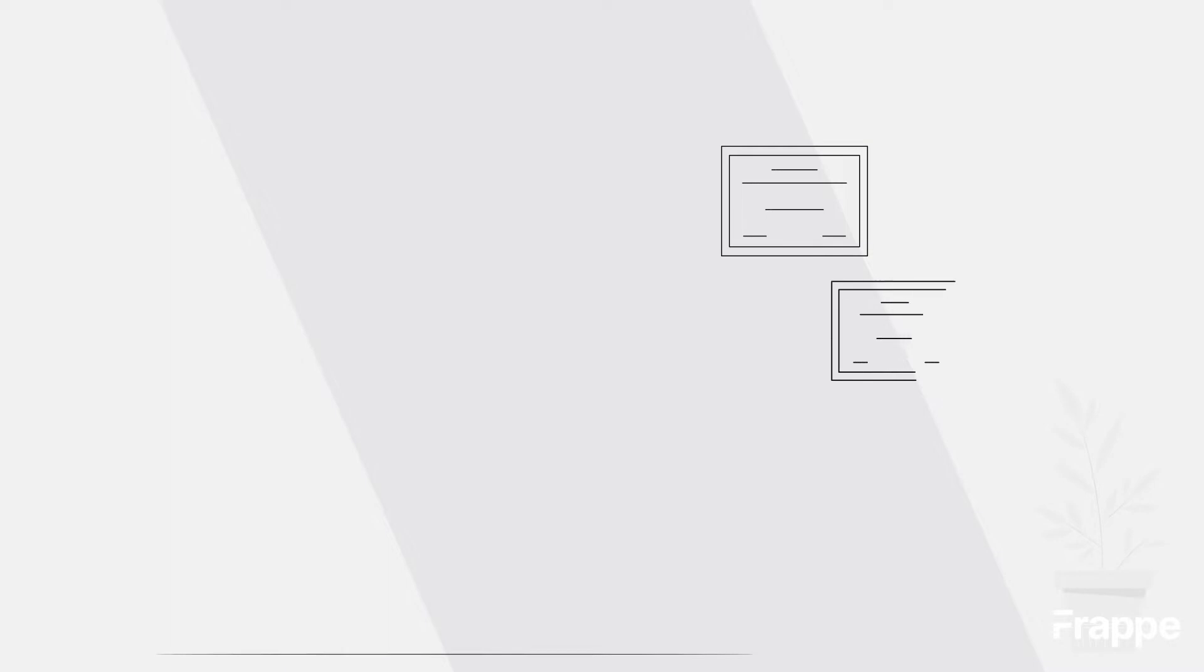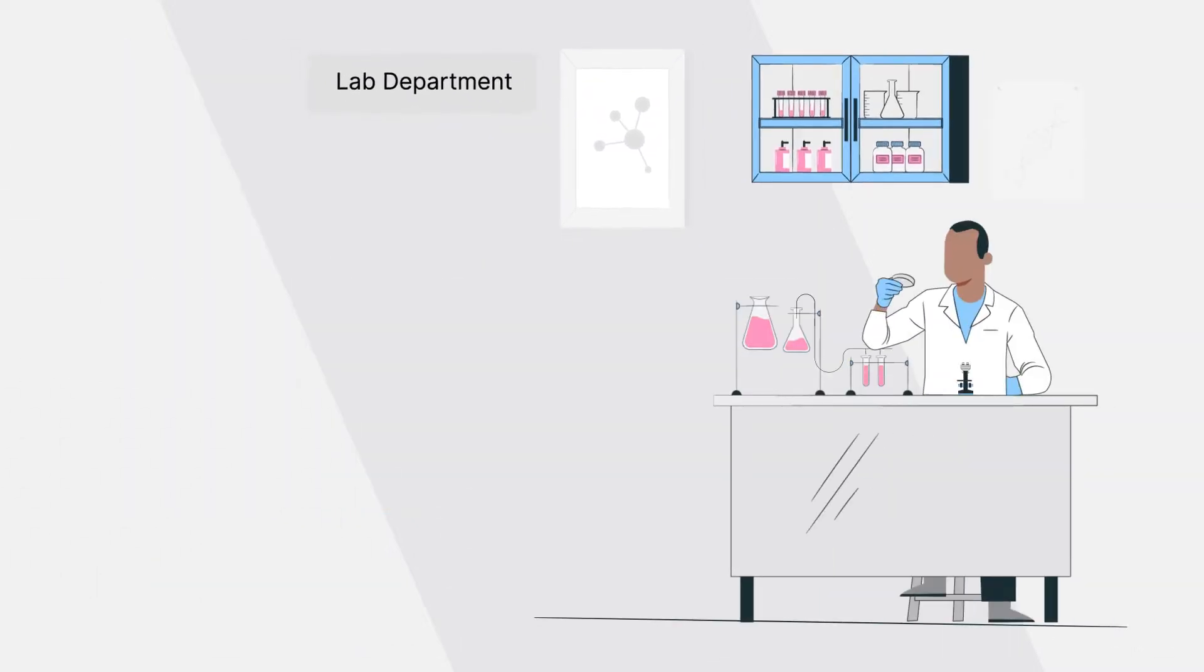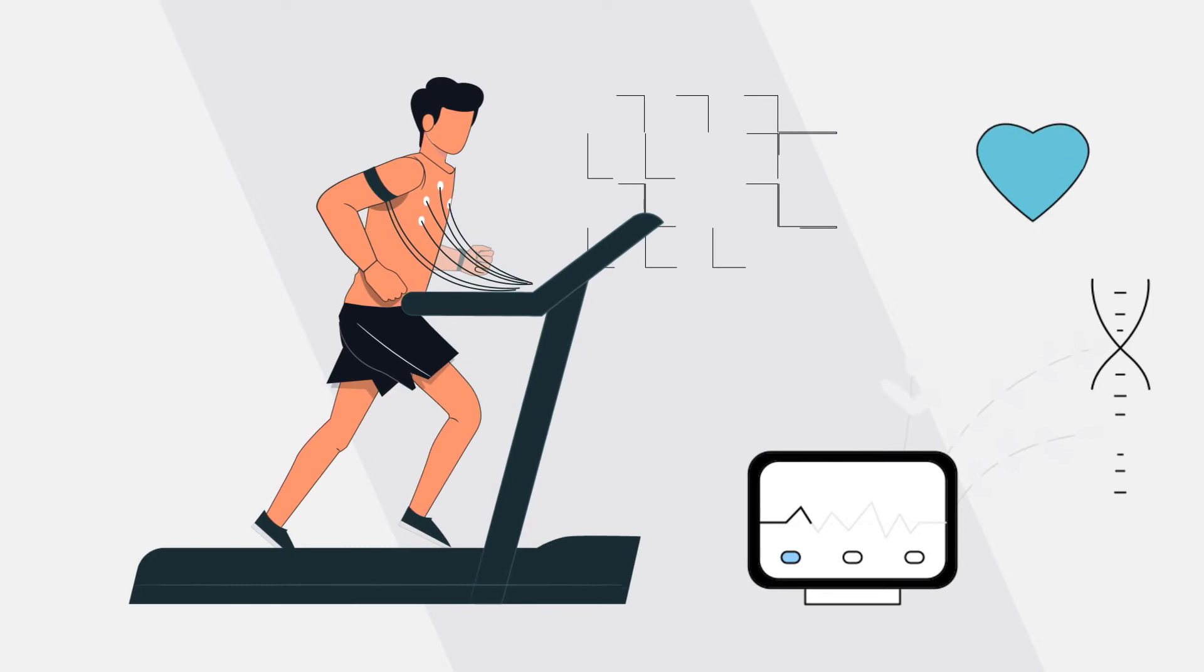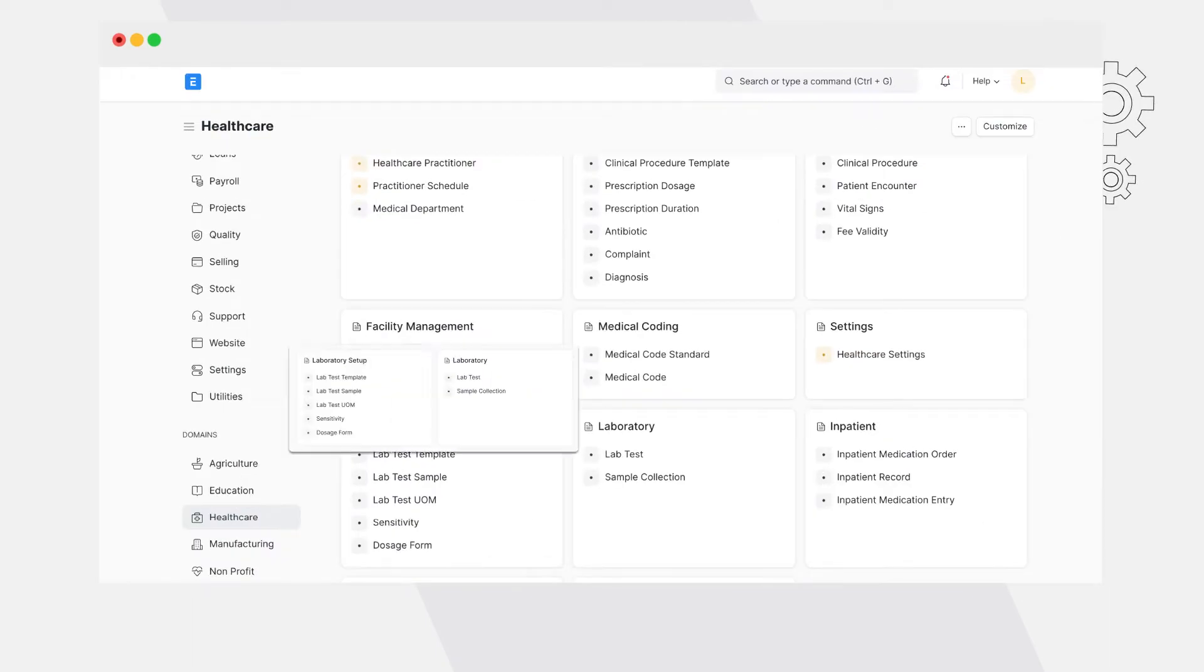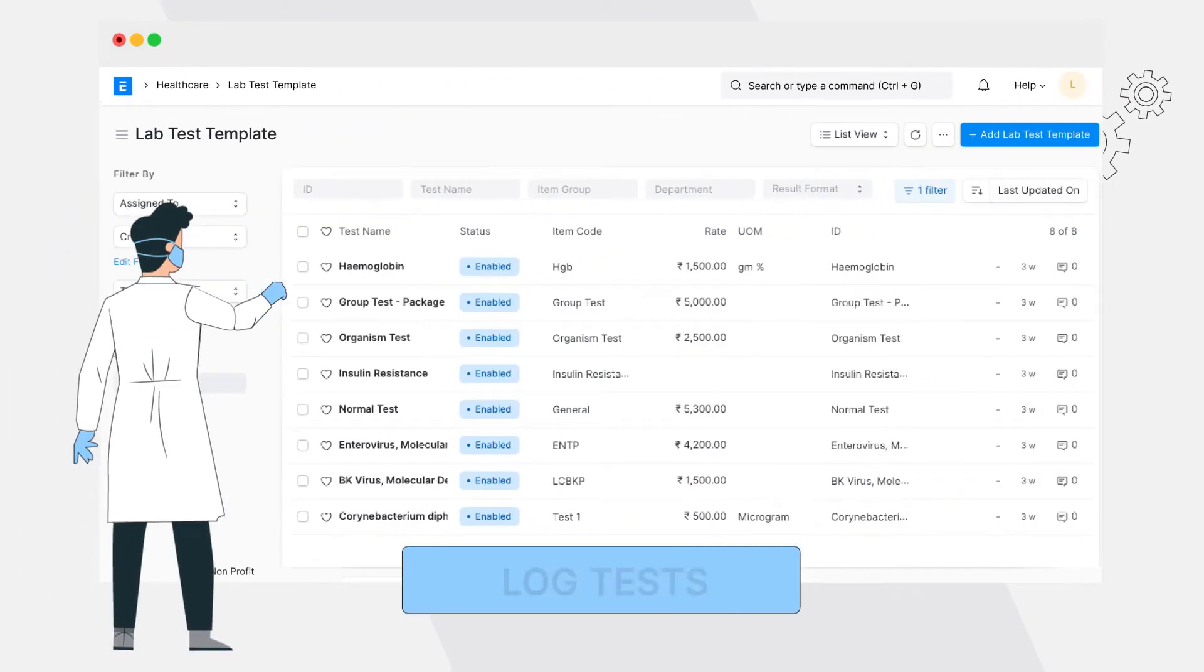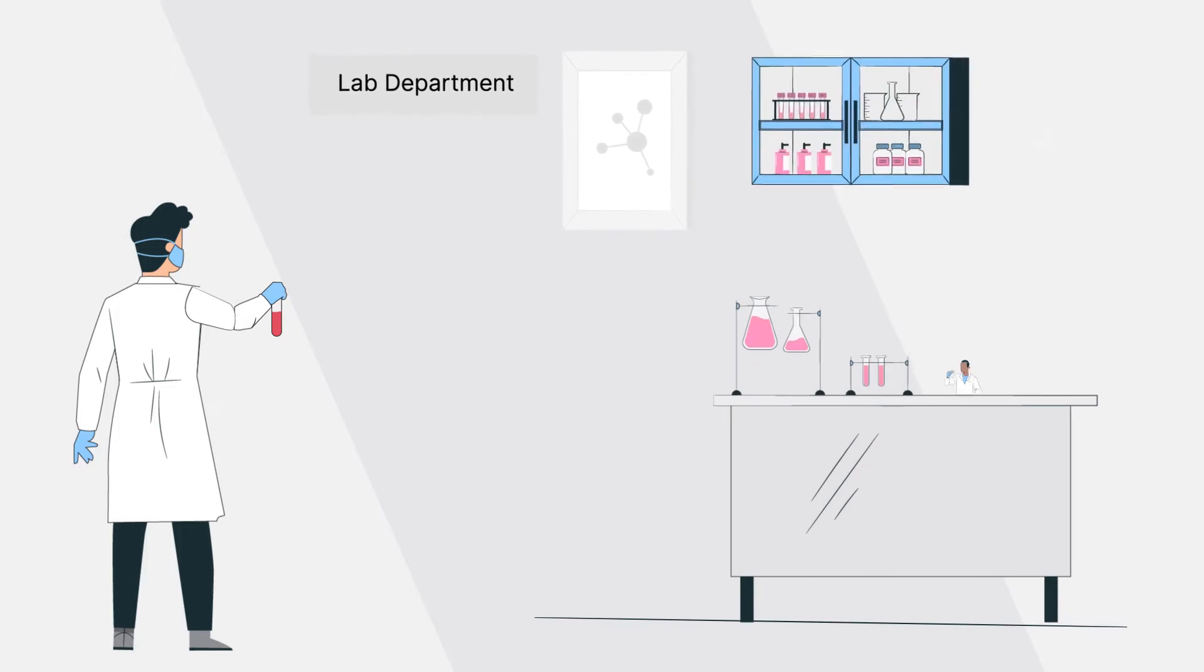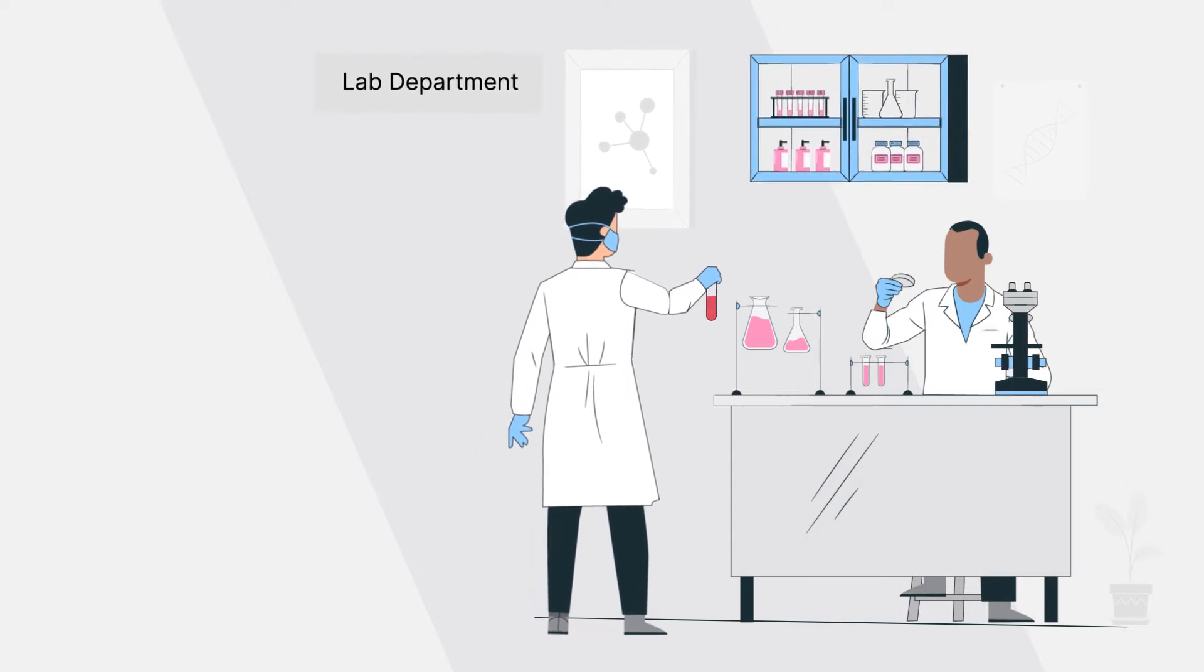Now let's assume our practitioner Steven suggests a CBC, stress test and MRI scan. But we also have a lab test unit within our healthcare system, which would mean that Blake just needs to visit the lab department and get the test done. However, there are a few configurations required in the lab management department which allows our lab technician John to log test requests, collect samples, conduct tests and give out results. Let's understand what configurations will be required by John so that we can ensure a fast-paced lab testing service.